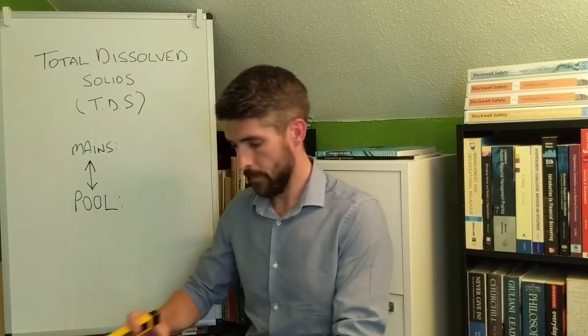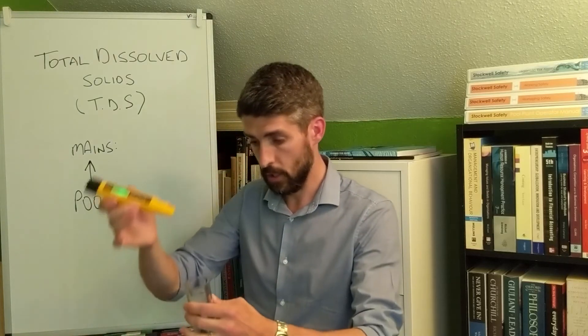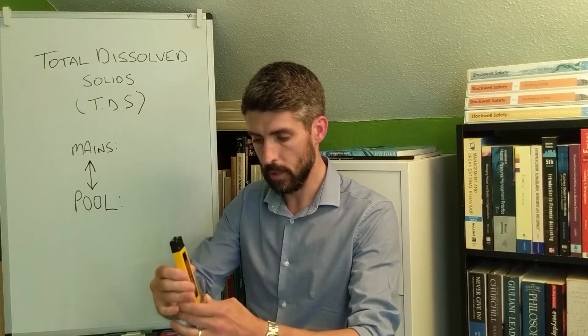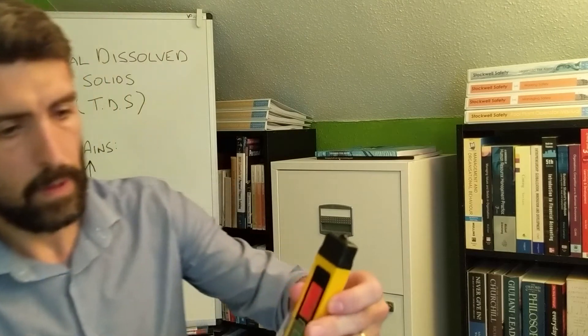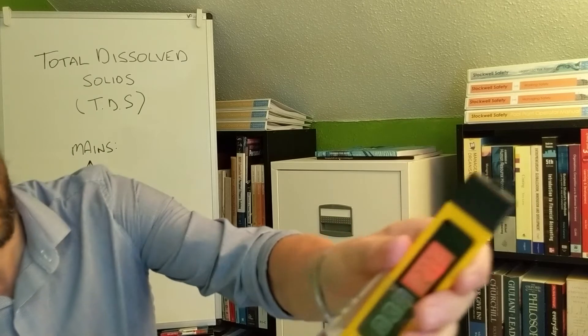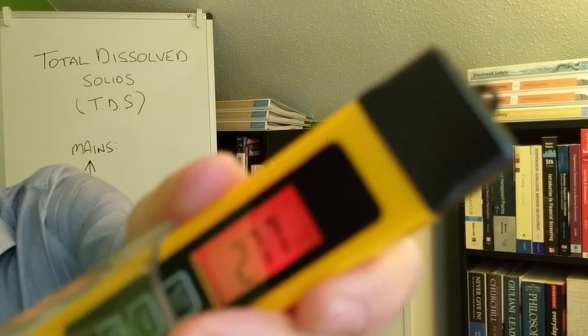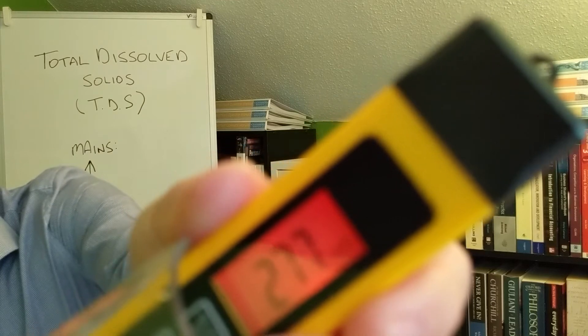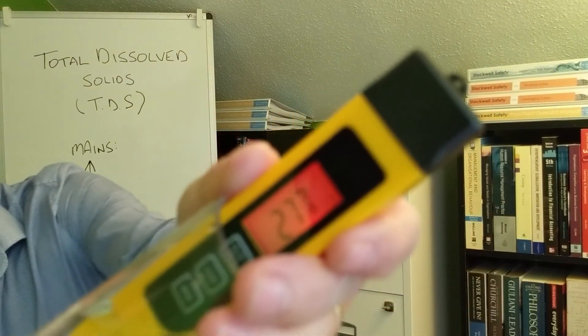So it's a case of turning it on and all you need to do is dip it into a sample, and the result will be shown in parts per million. So I'm getting 277, I think it's saying, so I'm hoping that will focus properly to allow you to see that it's 277 parts per million.